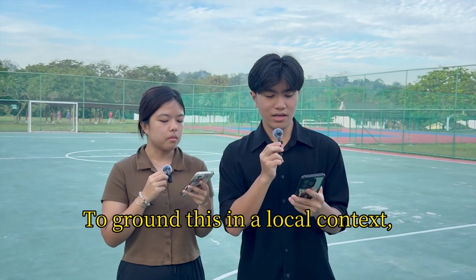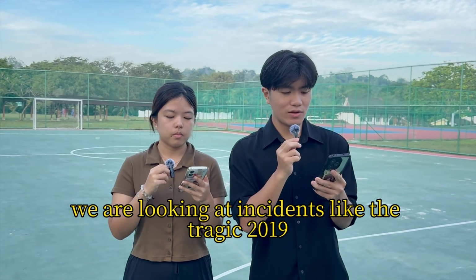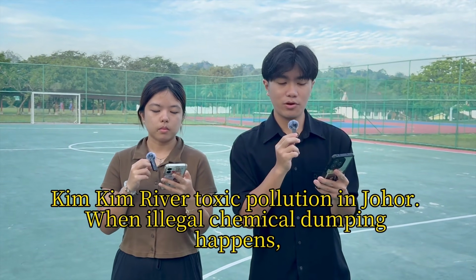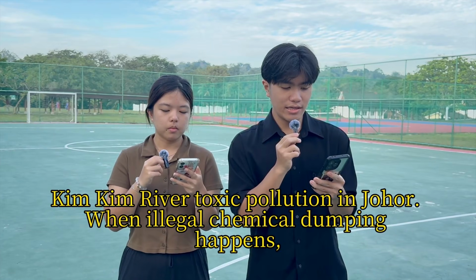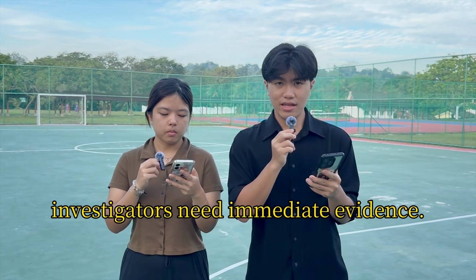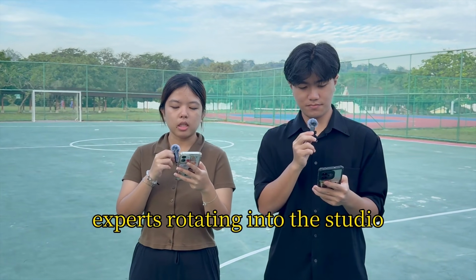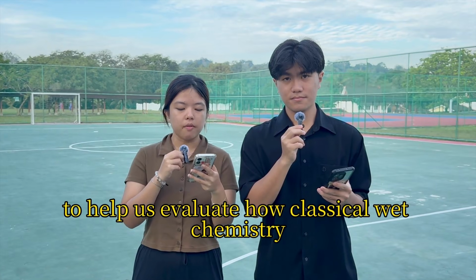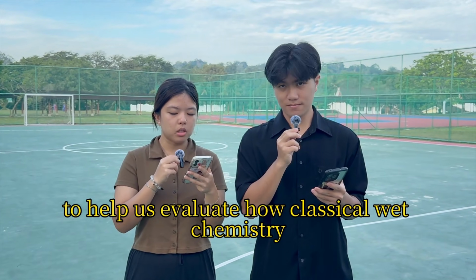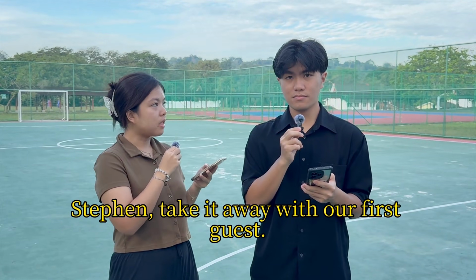Today, we are fulfilling our analytical chemistry test project. We are focusing on environmental forensics, evaluating how we test water quality using acid-based titration. To ground this in a local context, we are looking at the tragic 2019 Kim Kim River toxic pollution in Johor. When illegal chemical dumping happens, investigators need immediate evidence. Exactly. Today, we have 4 experts rotating into the studio to help us evaluate how classical wet chemistry tracks down the culprit. Steven, take it away with our first guest.